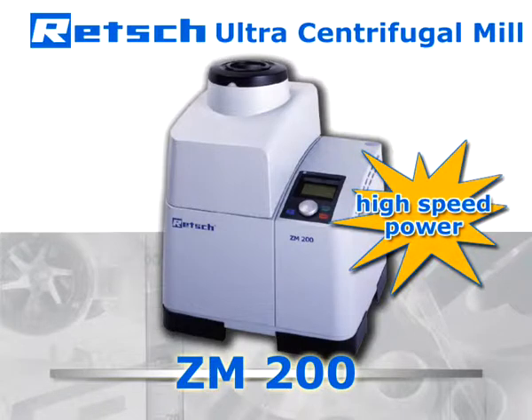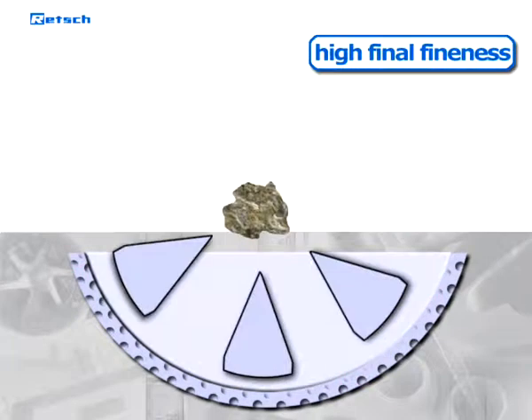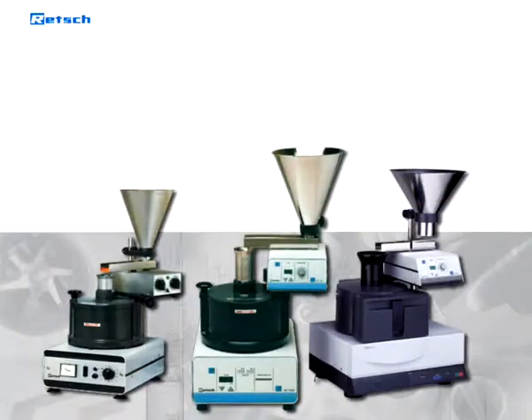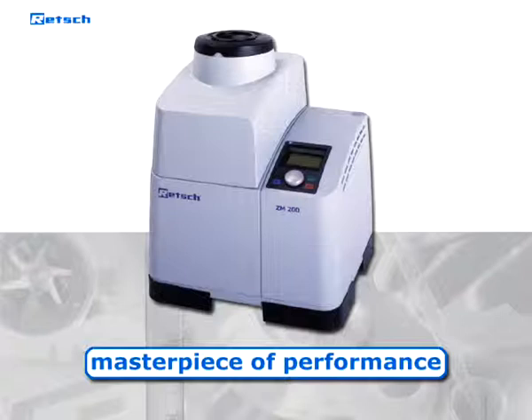This high-speed rotor mill allows for rapid but also gentle size reduction and for achieving a high final fineness of soft-to-medium hard and fibrous materials. Our ultra-centrifugal mills have been on the market for decades and became Rege's flagship products. The latest version, ZM200, is a masterpiece of performance and ease-of-use.